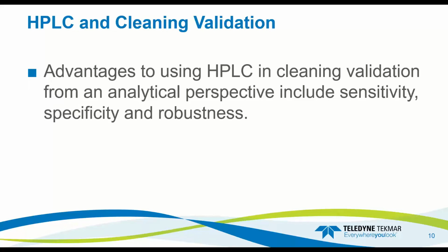There's a great advantage to using HPLC in cleaning validation. From an analytical perspective, it includes a lot of increased sensitivity, a lot of specificity, and robustness. If we're looking for a certain type of compound and we know that compound is going to give us that peak and we are able to develop an analytical method for that, that is great. We can find that and we can do our analysis on that.